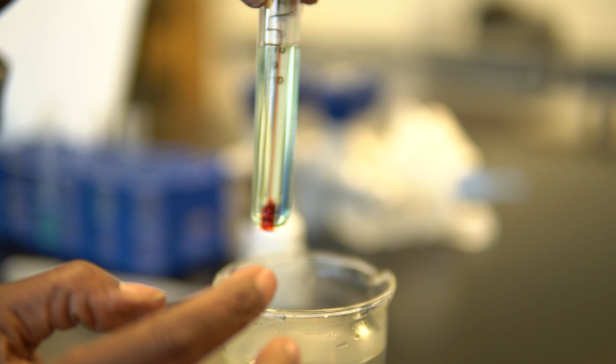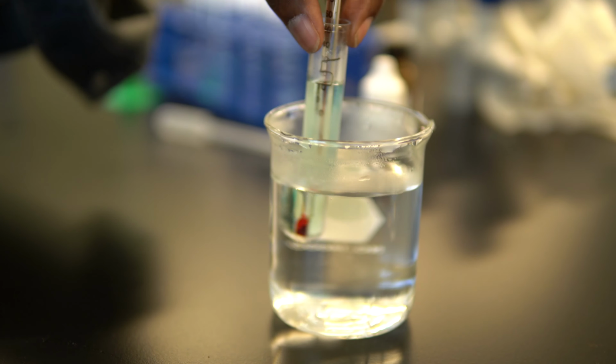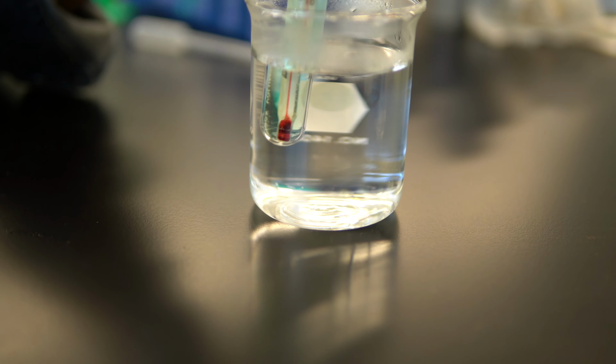Place test tube number 5 into the hot water bath. Gently stir the solution with a thermometer until the temperature is approximately 50 degrees.